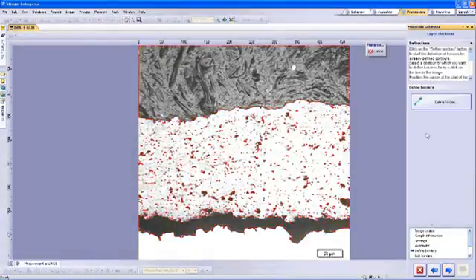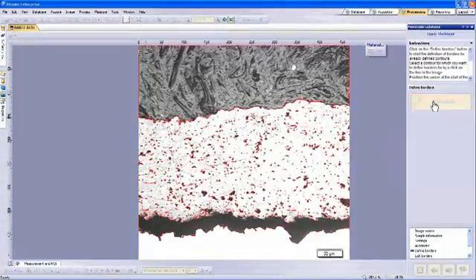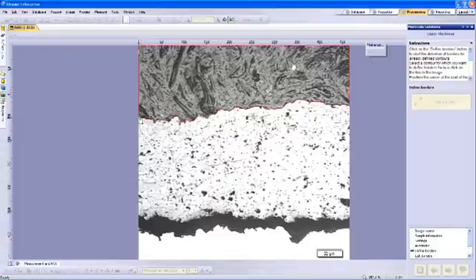We can now define our borders based on the background contour selections we defined in the previous window. Click on Define Borders. Now simply select the first contour line you wish to define by clicking on it. After we select that line, the software will then allow us to place the marker point at each end of the contour line. We will place the first point to the left side, then the second point to the right side, marking our entire contour line.